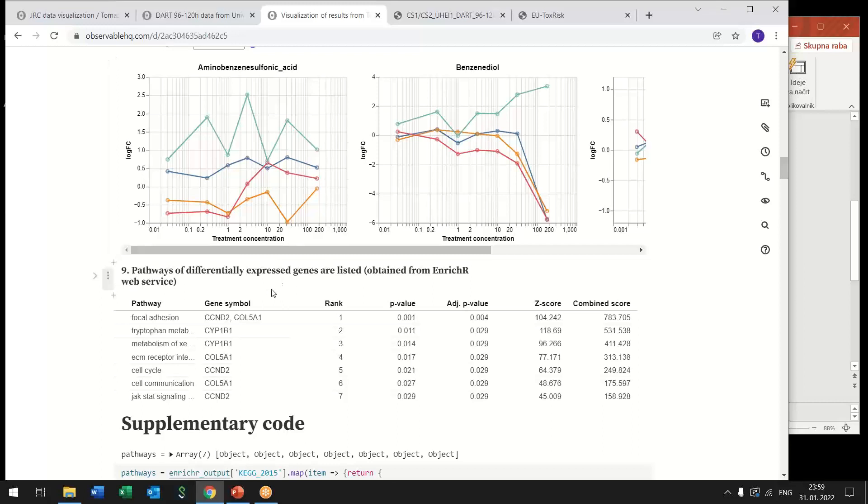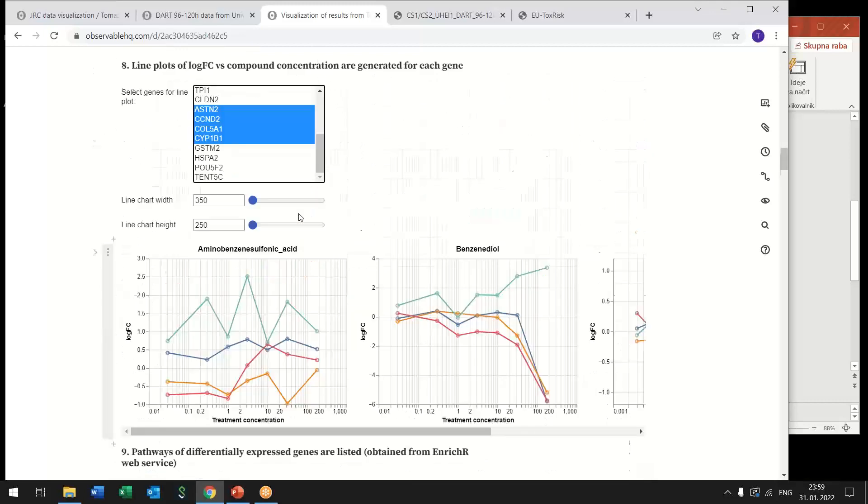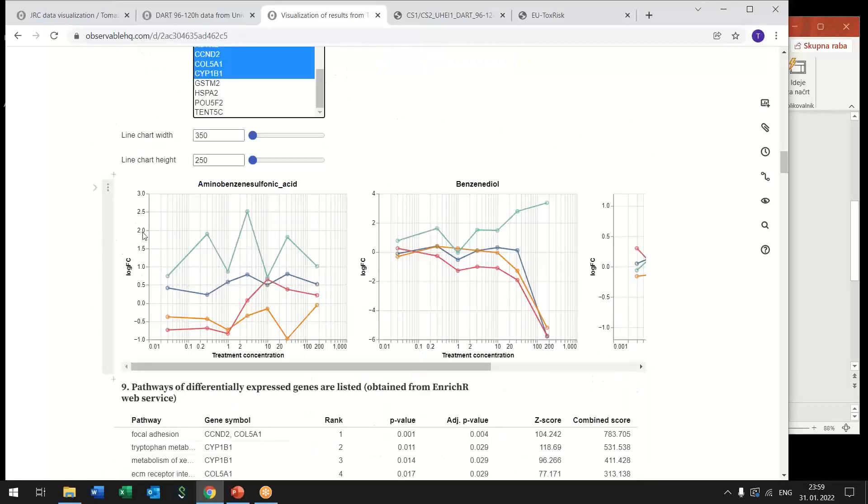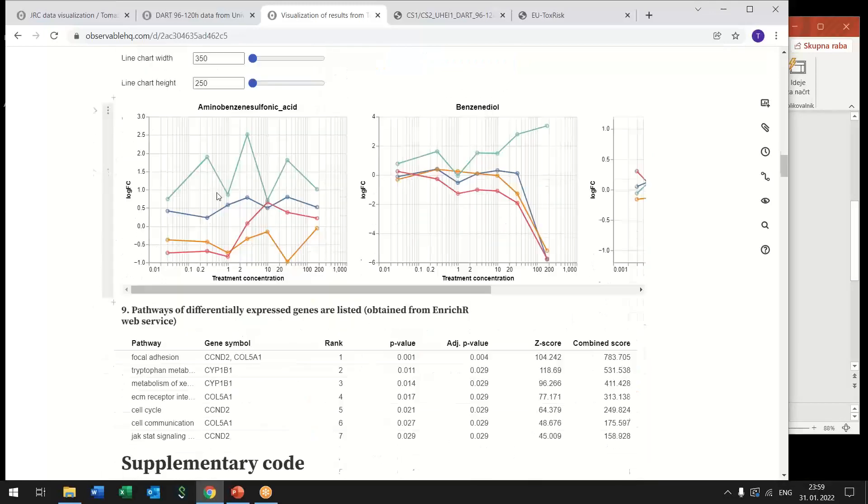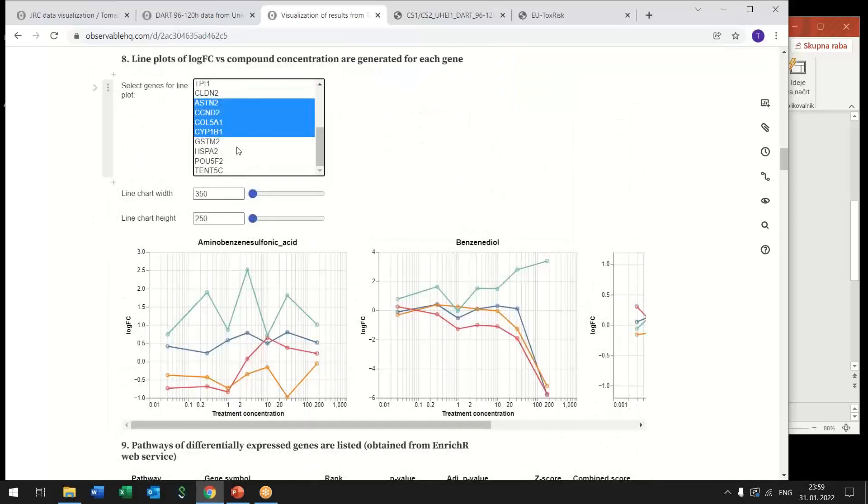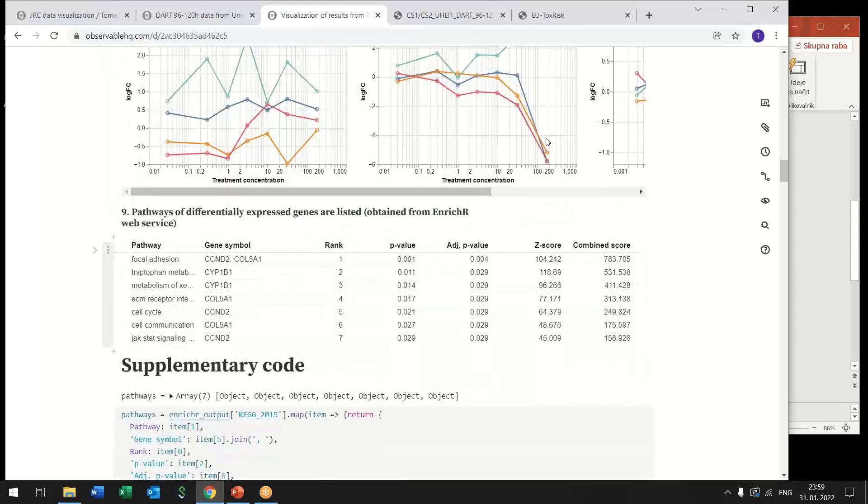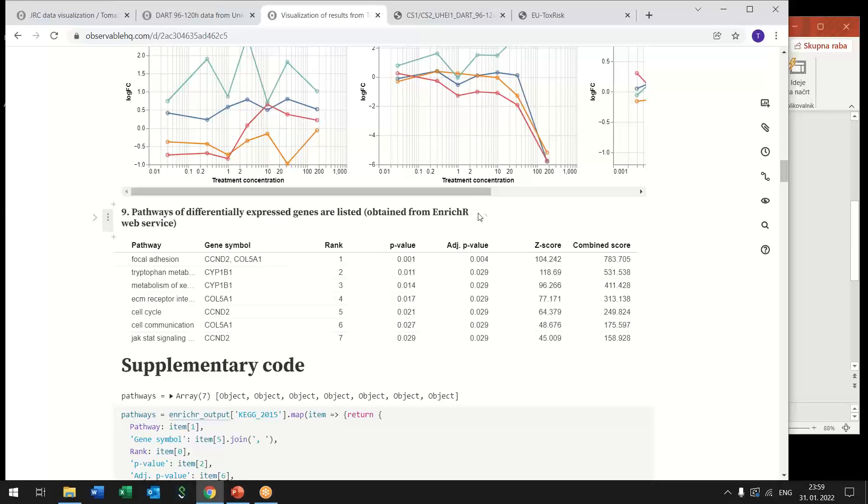But here we also make use of another web service which is Enrichr and this web service returns us pathways in which the selected genes are involved so here I selected four genes and immediately after I make this selection request is sent to this Enrichr web service and we are returned a list of pathways ranked by their relevance.